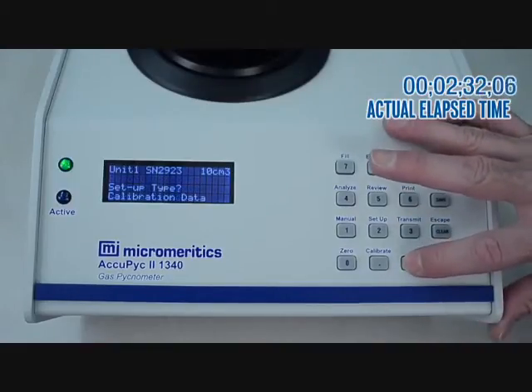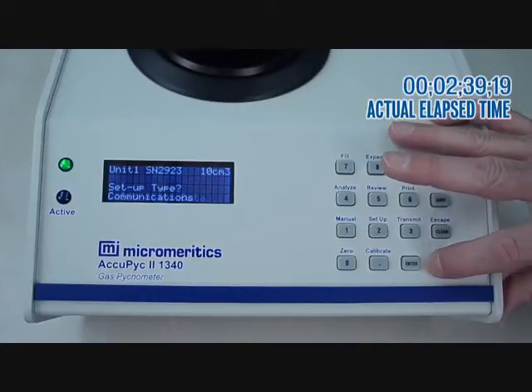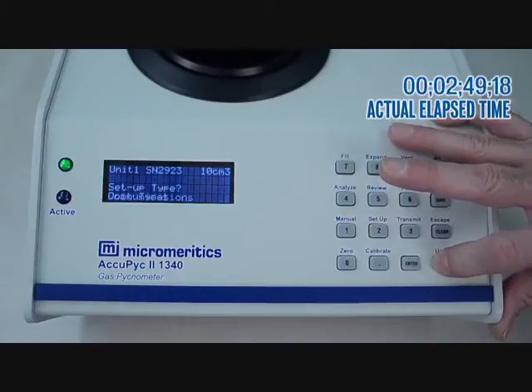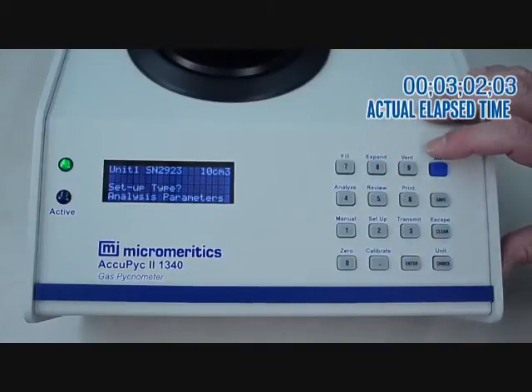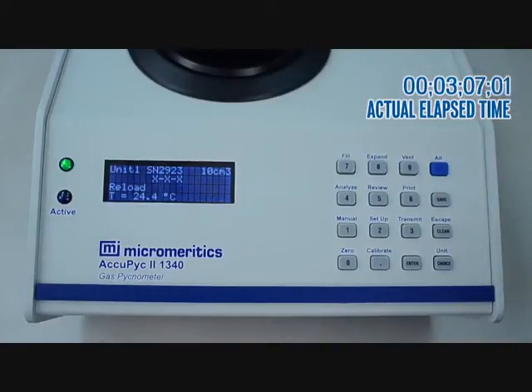Using choice, we can select calibration data and view the calibration for the cell volume and for the expansion volume. Pressing choice, we can look at communications parameters for electronic communication. Choice again, we can set types of units, including language, and date and time. Pressing choice takes us back to the analysis parameters. We will press save to save these settings.